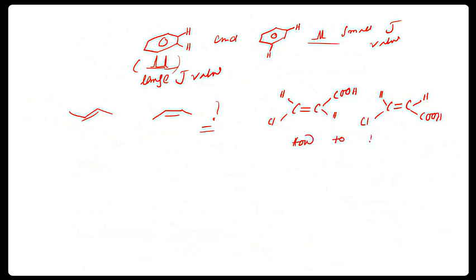How to differentiate? Very interesting point. Differentiate by NMR. Then what's the rule?